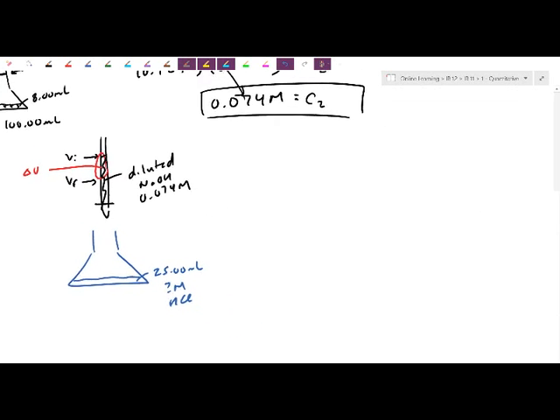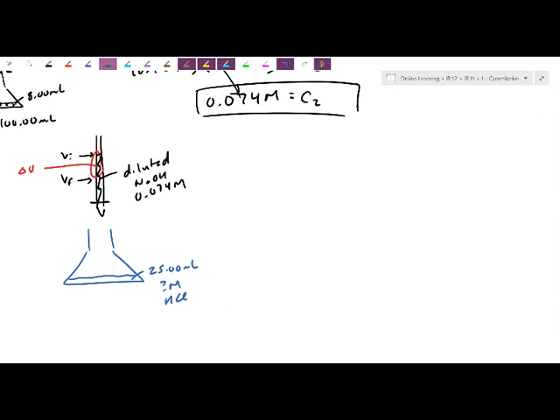Let me just copy down the numbers I had to the side. I also did 3 trials of this. Of course, I would have wasted more solution because the pipettes are actually 25 milliliters. But again, the advantage of doing 25 mils is that it guarantees that the titrant volume, the difference, the amount that you're actually tossing in, is something bigger than 10 milliliters. That's going to have one more sig fig than what we saw yesterday. So let's see how that looks here.